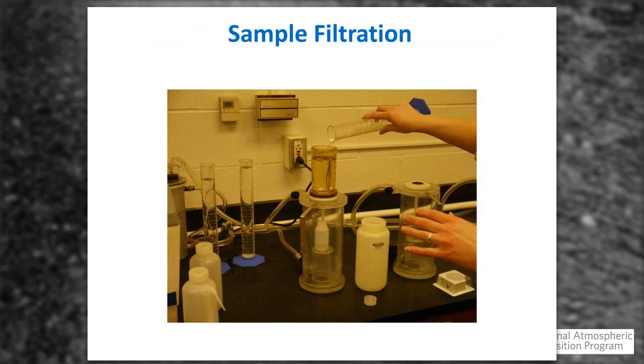Let's go on. After we measure pH and conductivity, all NTN samples are filtered. And this is just a shot of Christina filtering one of our samples. We collect one bottle that goes to the laboratory for analysis. And we also maintain a refrigerated archive if volume permits. We keep that in the lab for 5 years. So if there's any question about the data, we can go back and reanalyze that sample. Periodically, about once a year, we make you aware of archive samples available. After 5 years, we make those available to outside groups and other researchers.